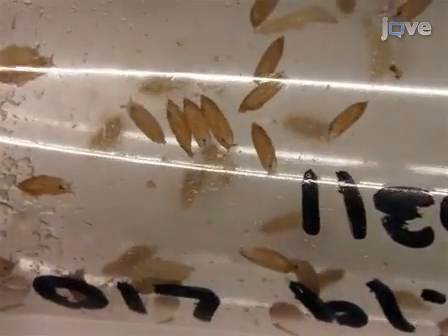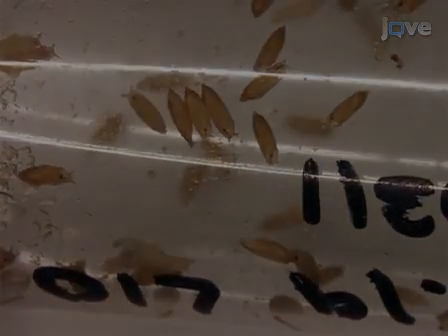Start staging specimens at the end of the 3rd instar larval stage when the puparium is formed.